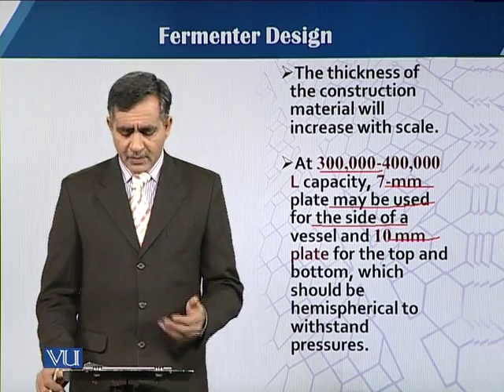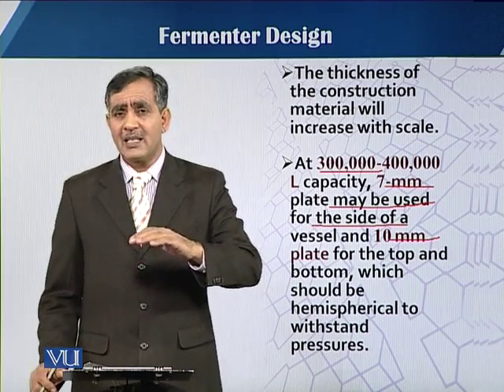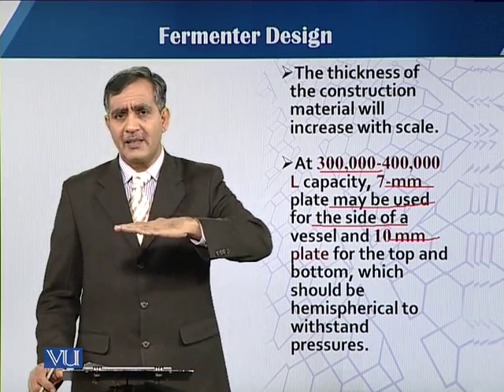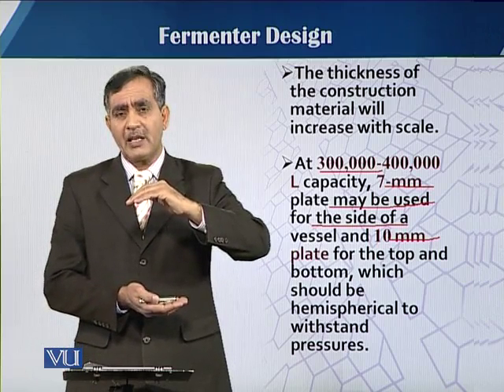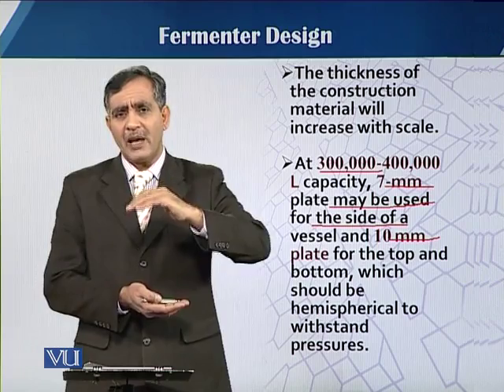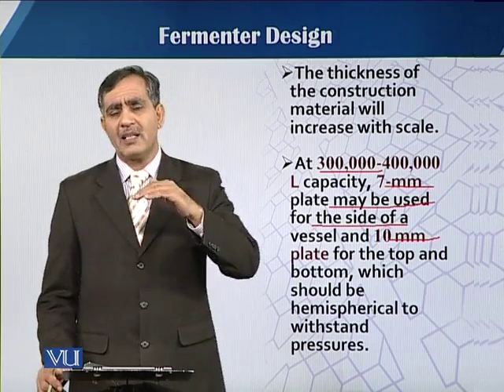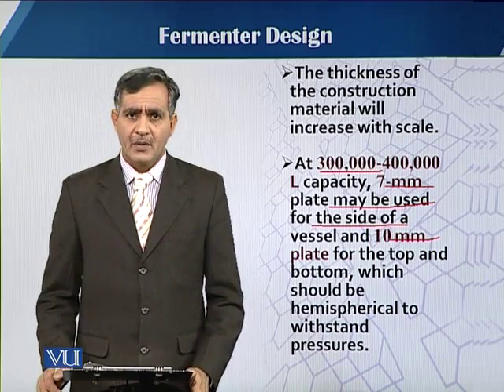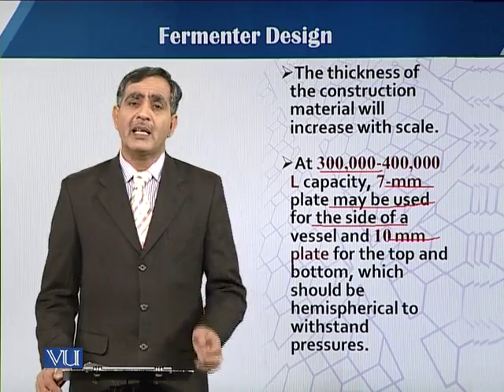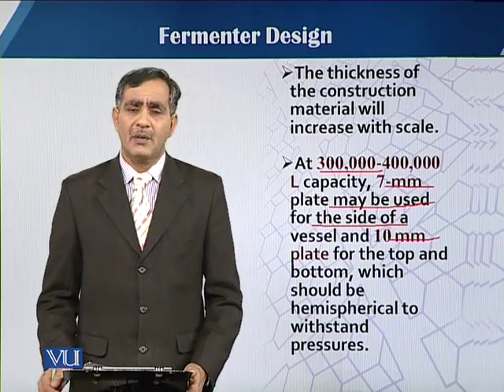That is suitable. And the major thing is that it should not be flat; it should be spherical, because it is very good dimensionally to keep a semi-spherical bottom as well as top, rather than a flat surface or bottom. So it is very critical while talking about the thickness of the fermenter vessel.